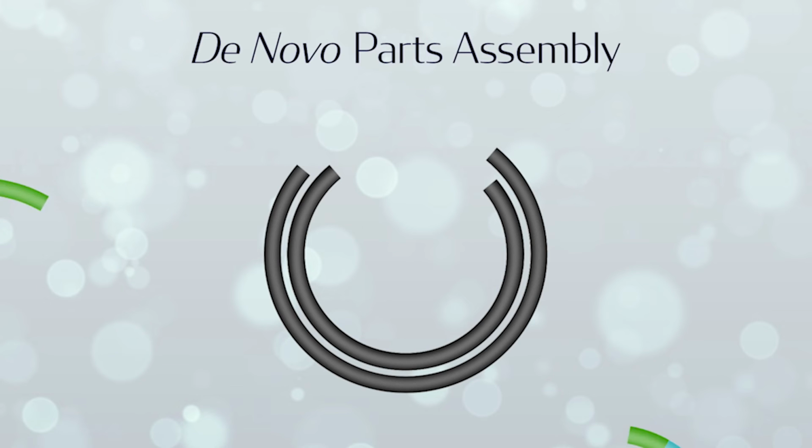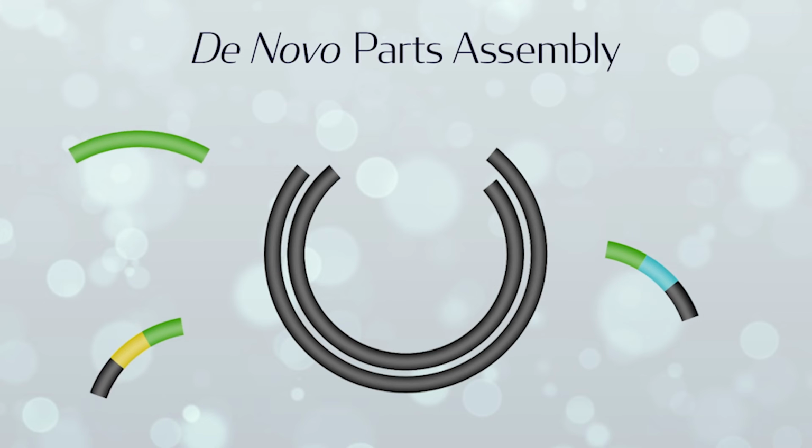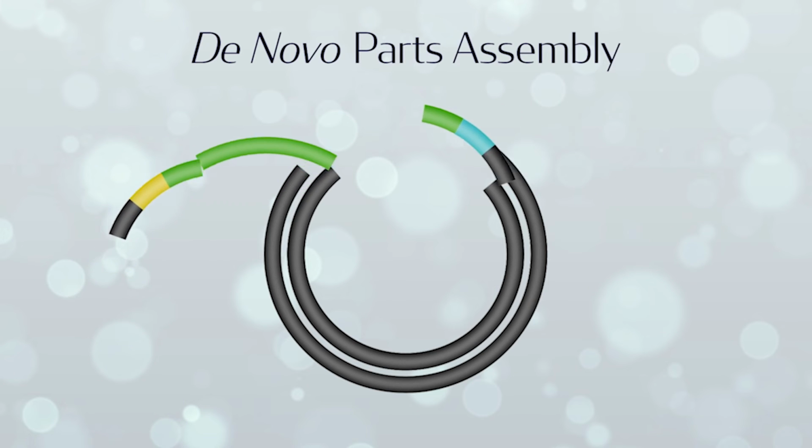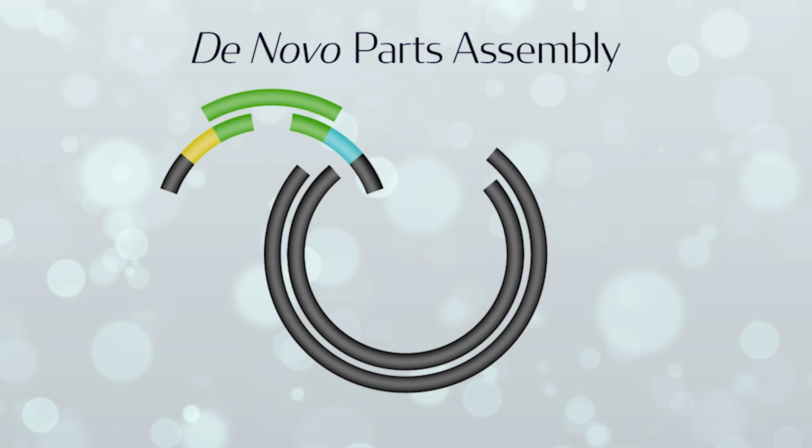Here, the designed DNA oligos with homologous sequences are added to the reaction. Several oligos can be merged together to create the desired insert. DNA polymerase fills up the nucleotide gaps and the added oligo becomes double-stranded.